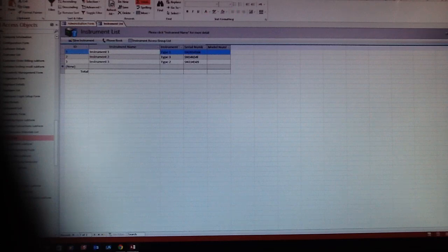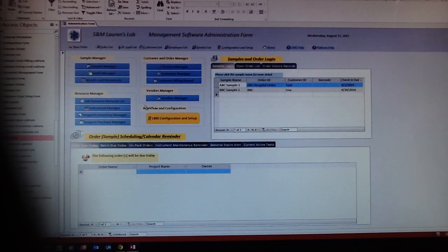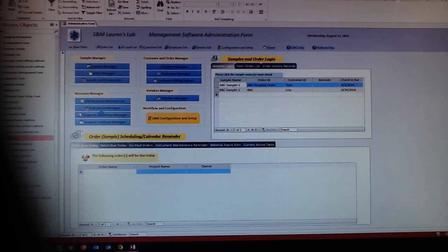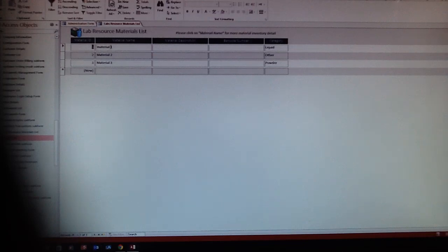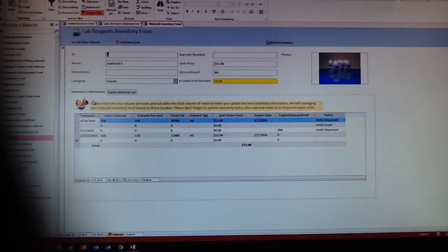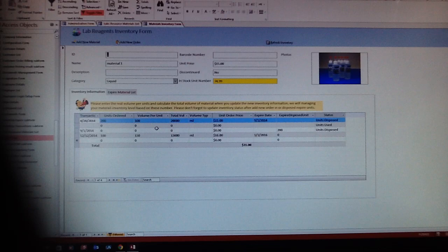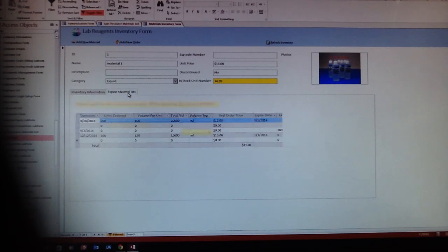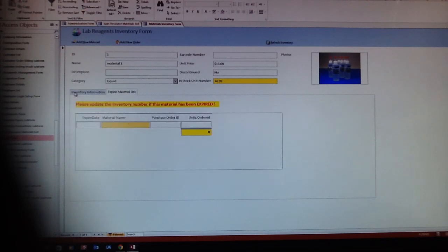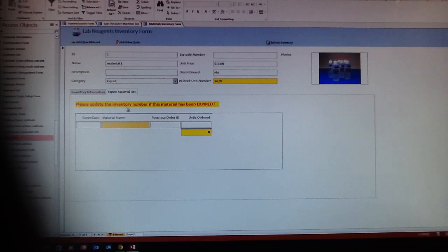Here is the inventory management. You put in material and they will tell you when you ordered it, how much you ordered, and they will put an expire list and tell you which one will be expired.